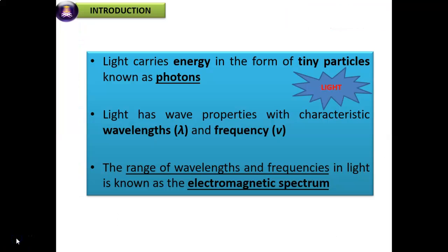So spectroscopy is the study of the interaction of electromagnetic radiation and matter. So what is actually electromagnetic radiation? It is any form of radiant energy that is propagated as a wave and includes what we commonly call visible light. Electromagnetic radiation is characterized by the wave properties of frequency, wavelength, and also velocity.